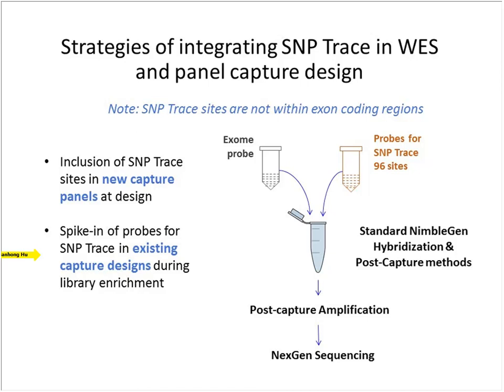So what we did is that we synthesized the probes for the SNP Trace sites separately, and then we combine them with the exome or other capture panel design into the tube, mix them together, and then use it for capture and then follow-up sequencing.